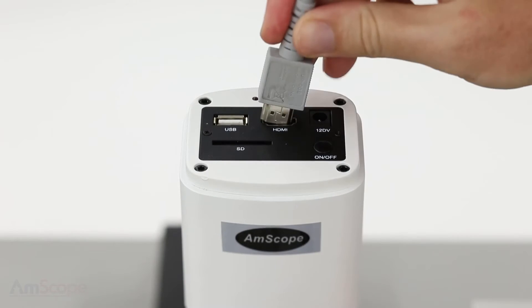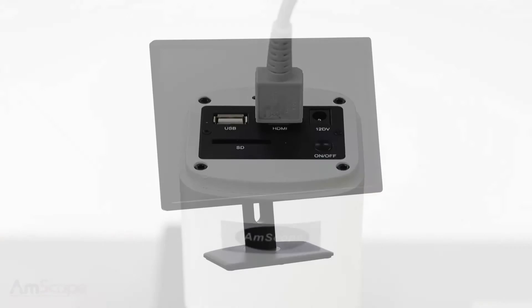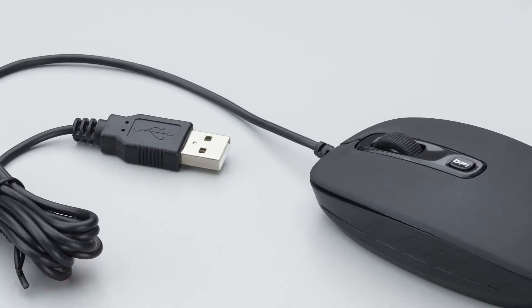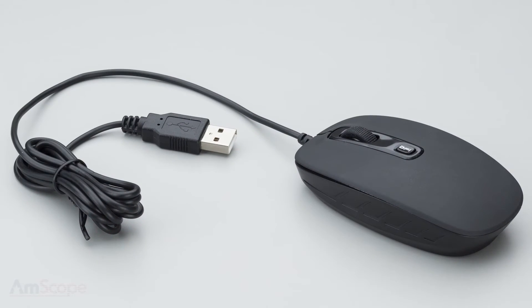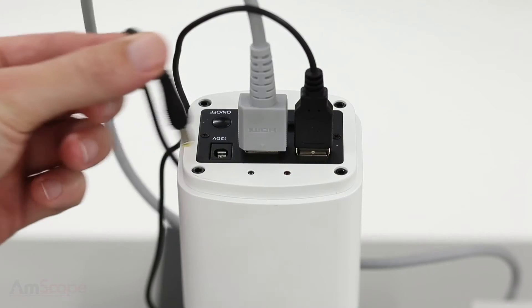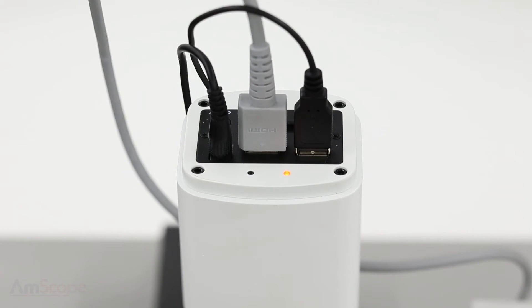Next, I'll attach an HDMI cable. This will give me a live view on a monitor or television. The camera includes a USB mouse, which is used to control the internal software. I'll plug this into the USB port. Next, I'll attach the power adapter. Once power is connected, this LED will light up.